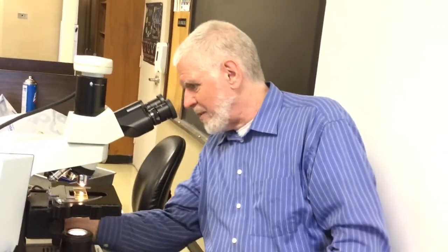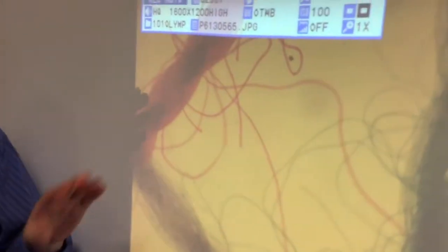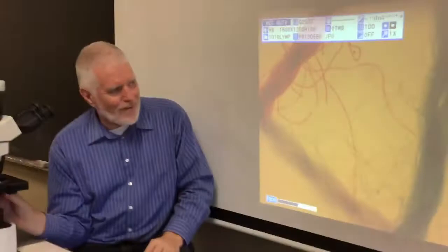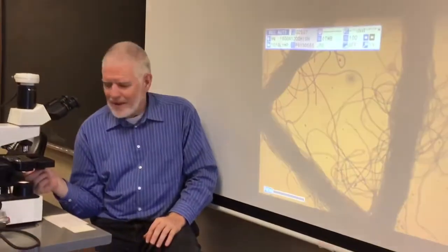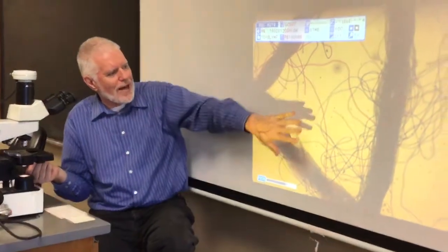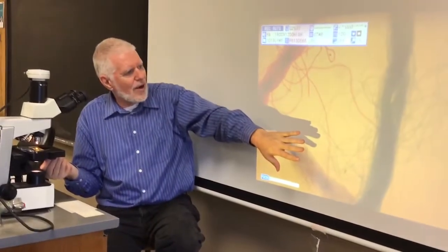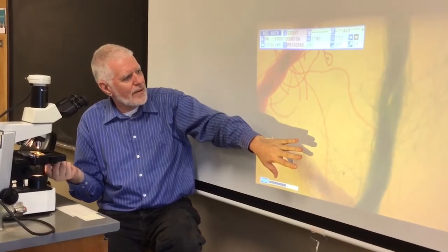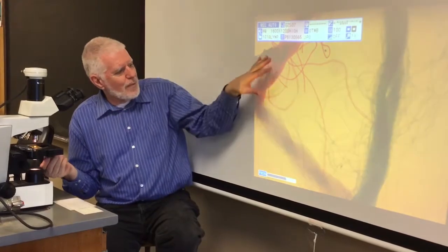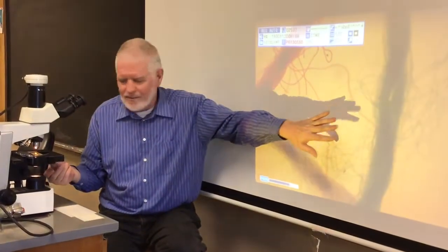Oh, this is way too bright now. Okay, we had the iris diaphragm, as I showed you before, which makes the spotlight. This is what happens when you open it and close it. You always feel underneath for the tab. There it's closed. You can see it increases the contrast for a lot of these pieces. And there it is open. It kind of overwhelms the video system a little bit, but it makes the colors more obvious.